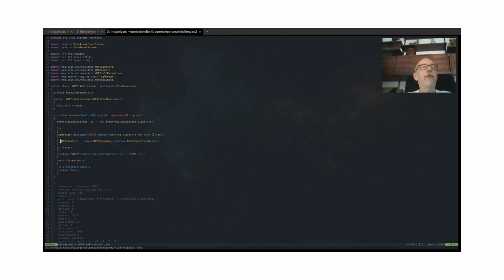The WDF files have a signature at the beginning of the file. I don't remember the numbers, but it's actually a string. It's 4 characters, and it's WDF and the version of the file.